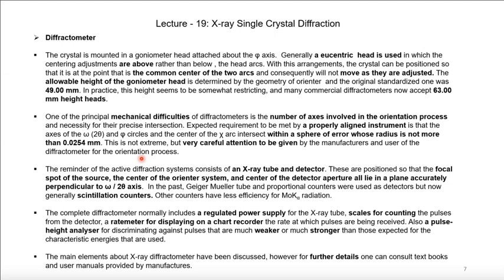We have now detected that some of the single crystal data by diffractometer, in papers already published, have mistakes with symmetry detection and also cell parameters, cell edges, and thereby the structure has to be determined again.